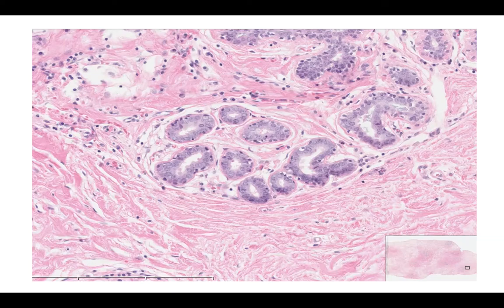The breast has two types of cells in the lobules. We can observe the first one, the luminal epithelial cells, here, as the cuboidal-shaped cells on the inner layer. The other cell type is the myoepithelium, which is the outer layer that rests on the basement membrane. The basement membrane is hard to observe on this slide, but it is the eosinophilic area which separates the ductal system from the adjacent stroma.